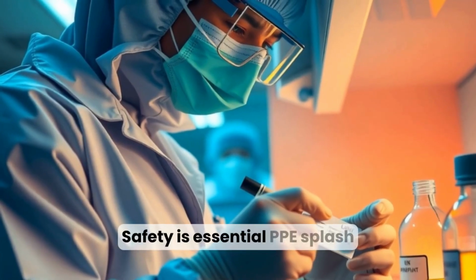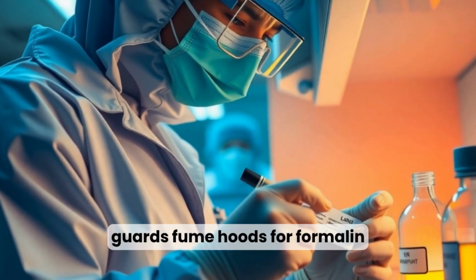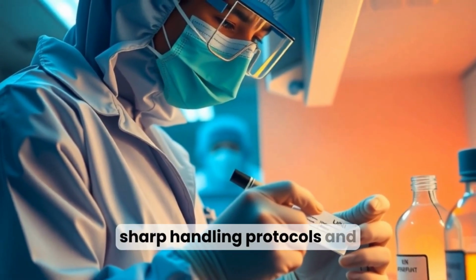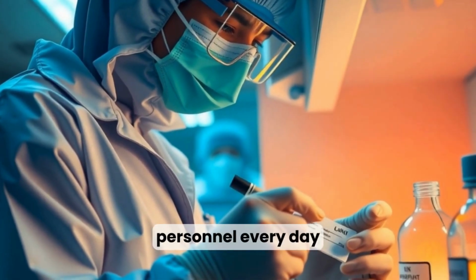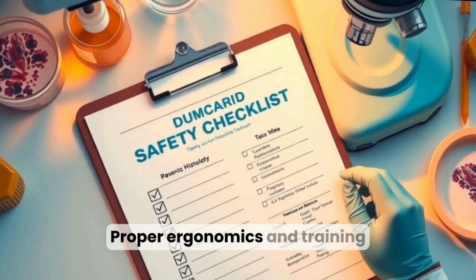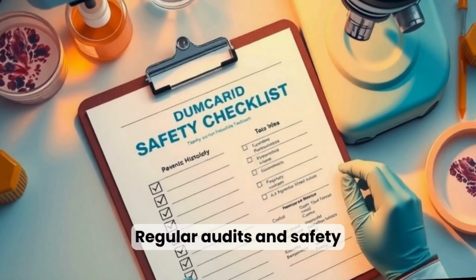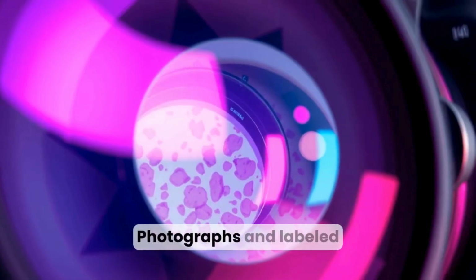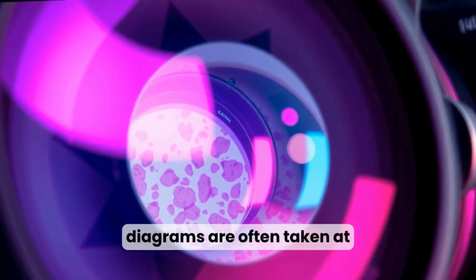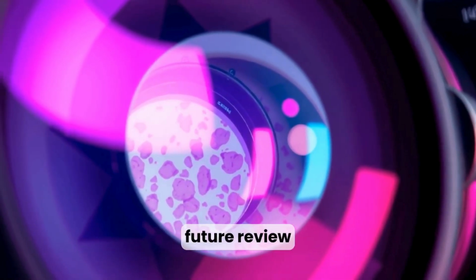Safety is essential. PPE, splash guards, fume hoods for formalin, sharp handling protocols, and spill procedures protect lab personnel every day. Proper ergonomics and training reduce errors and injuries. Regular audits and safety checklists keep gross rooms compliant and efficient. Photographs and labeled diagrams are often taken at grossing to document findings and assist surgical teams in future review.